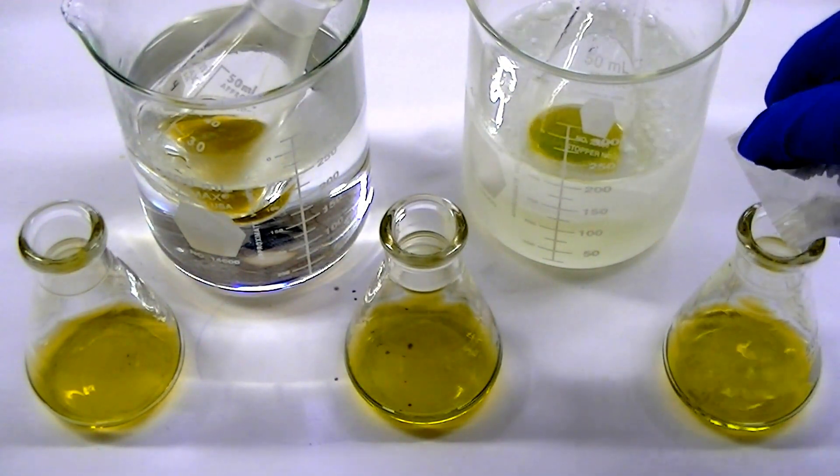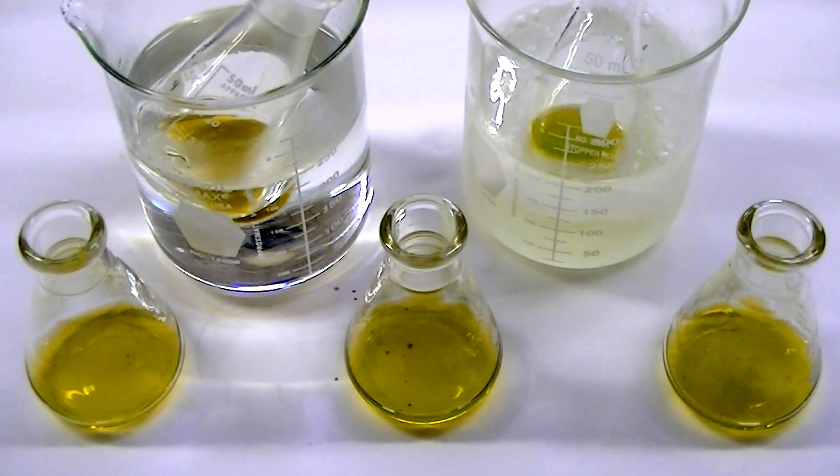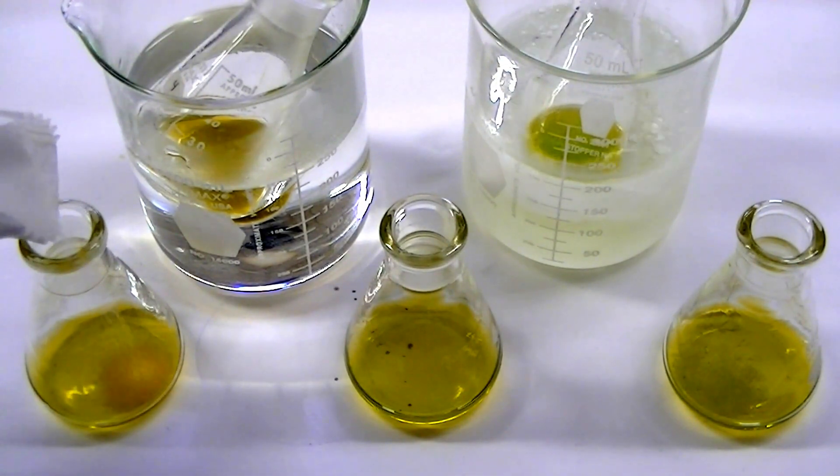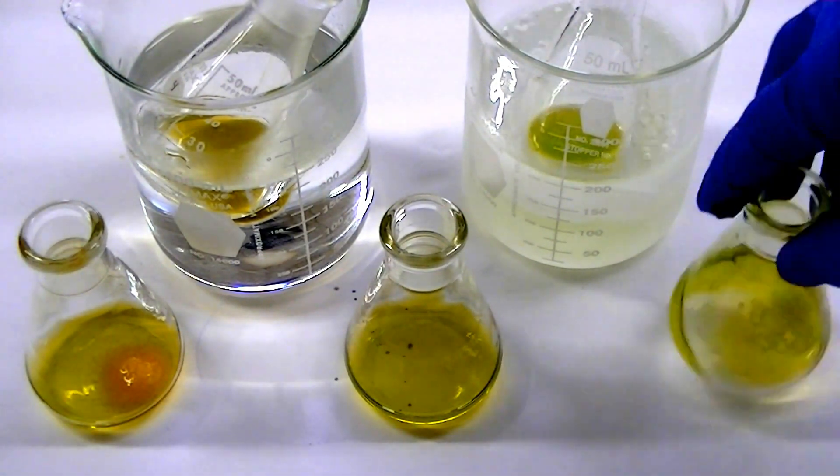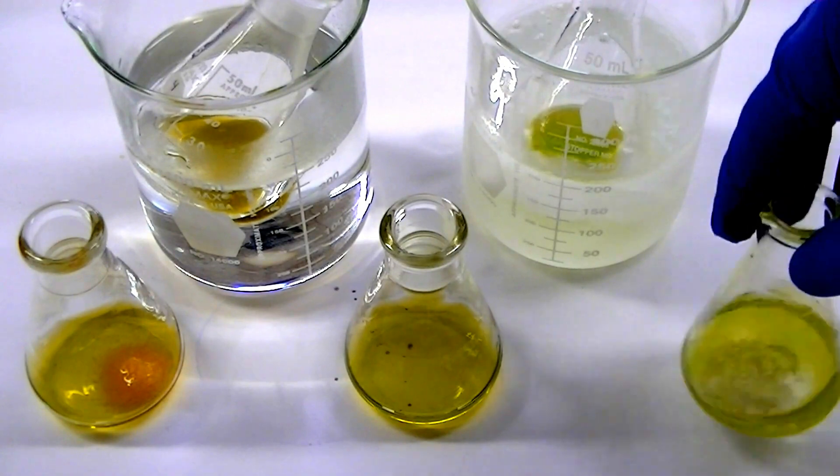To generate a blue color, we'll just add some silver nitrate. To get an orange color, we'll add a little bit of table salt. Let's describe the effect of addition of silver nitrate first.